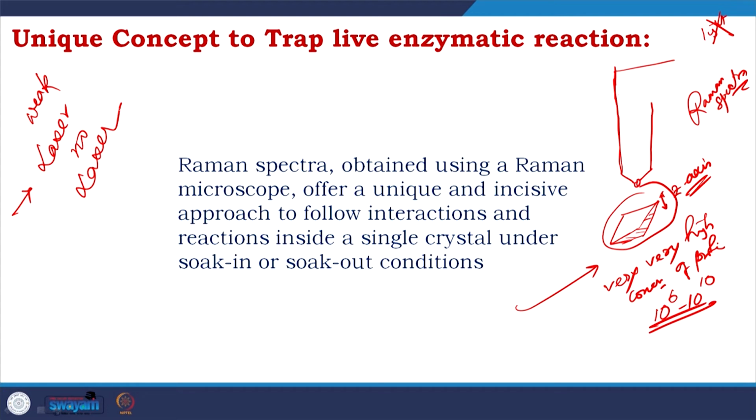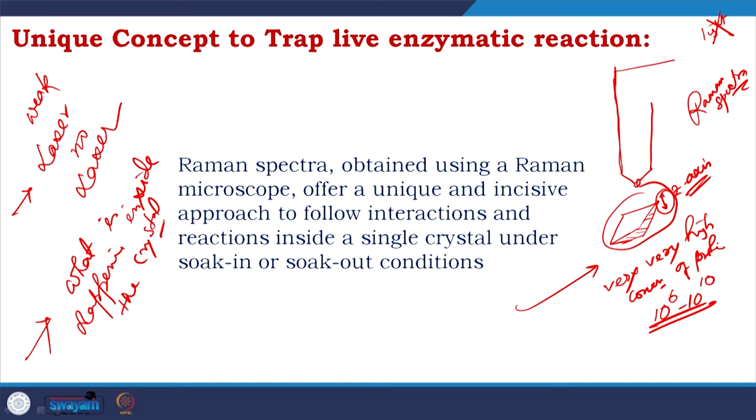Third advantage, you are only scanning the Z axis. So, you only look at what is happening inside the crystal. Why is it so interesting?